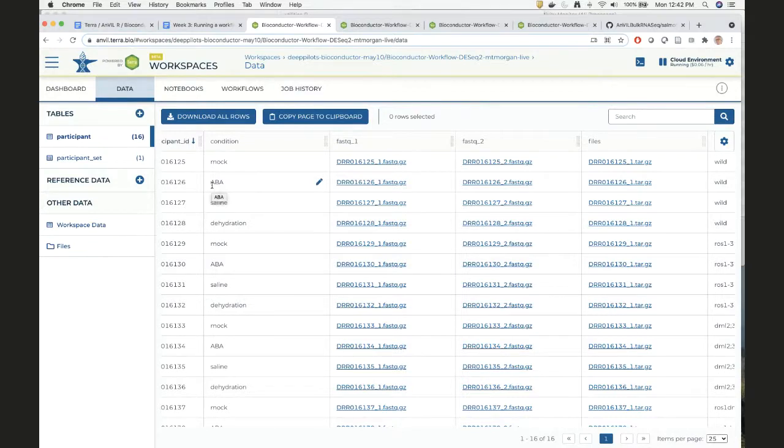But then the file itself isn't just these file names, like it has the GS links, right? So it would just be like a search and replace or something to prepend those GS:// to it.